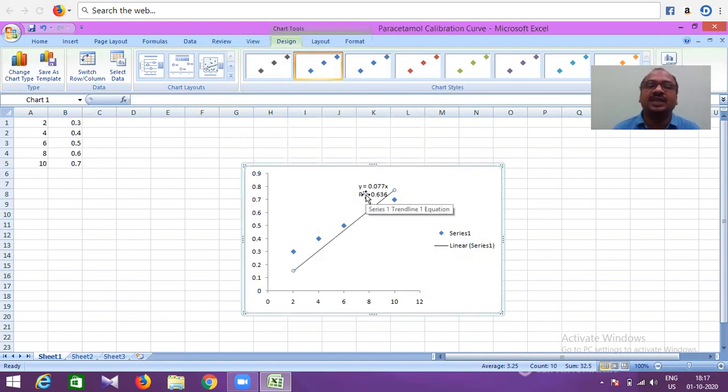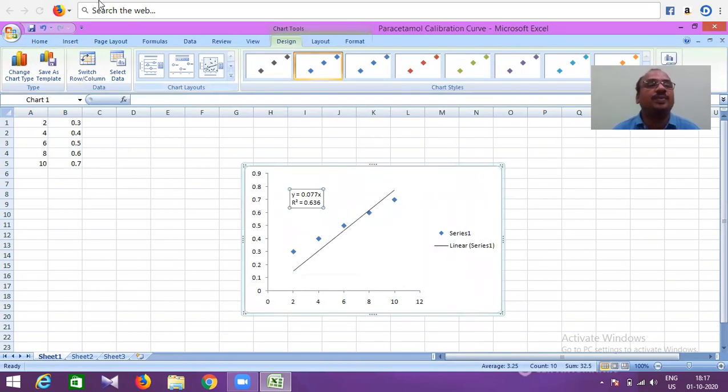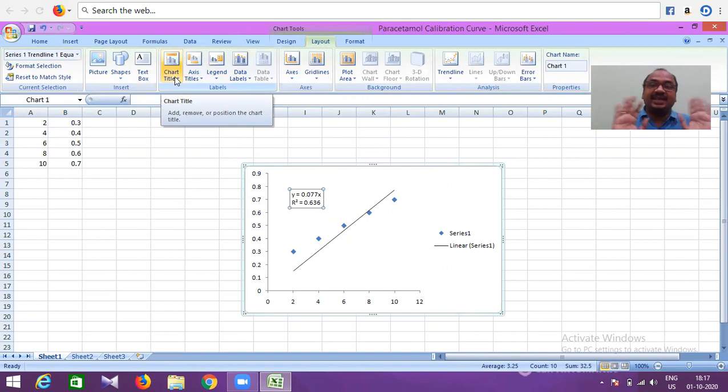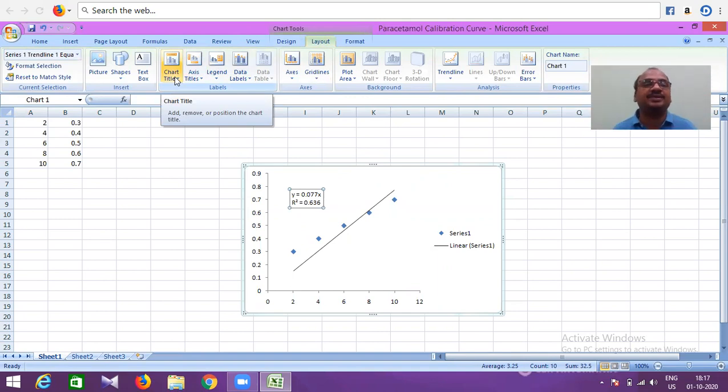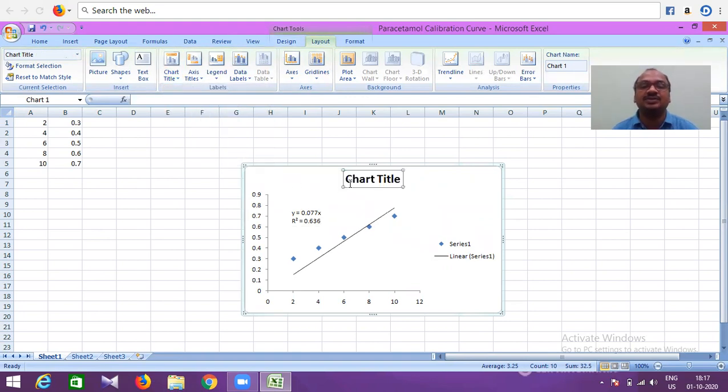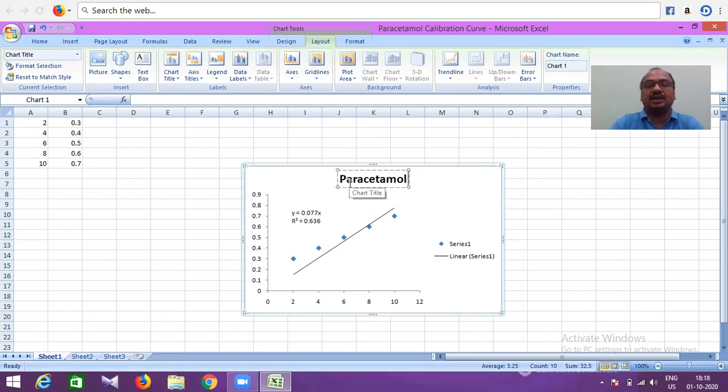Now, click on this, bring it here. Open the layout. Go to layout, and give a chart title—not X-axis title or Y-axis title, but the chart itself. Which style you want: like this, like this, or above the chart. Above the chart we'll place it. Here: Paracetamol Calibration Curve.